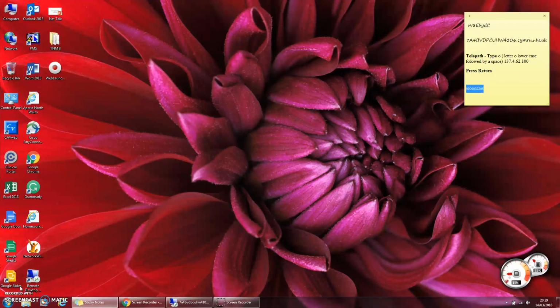Hi and welcome to this instructional video on how to get into the new LIMS system called Trak. I'm sure there's millions of people watching this, so I'll try and do a good job.